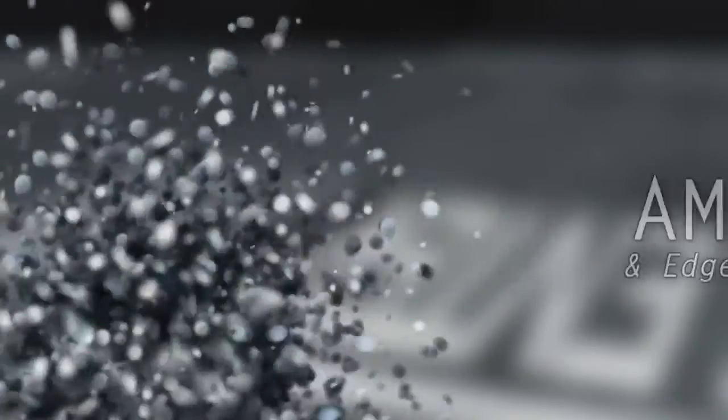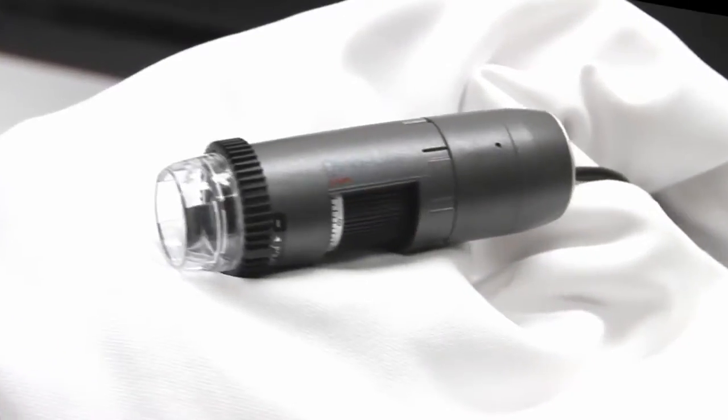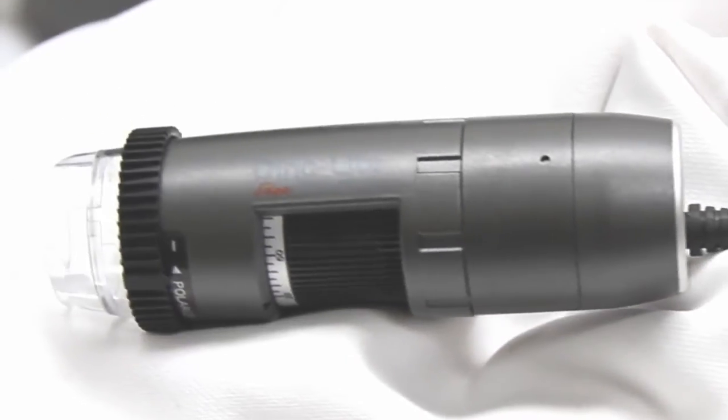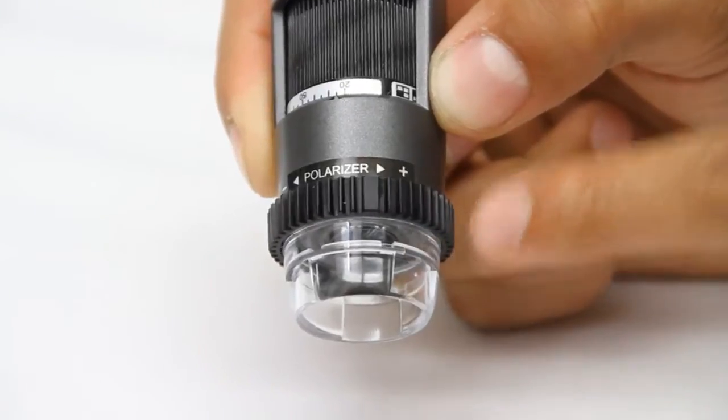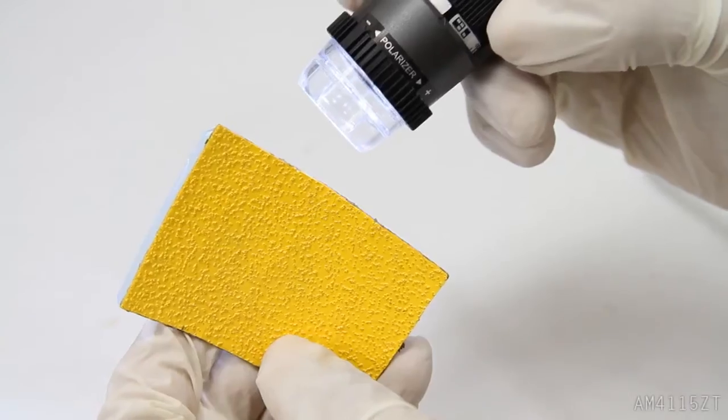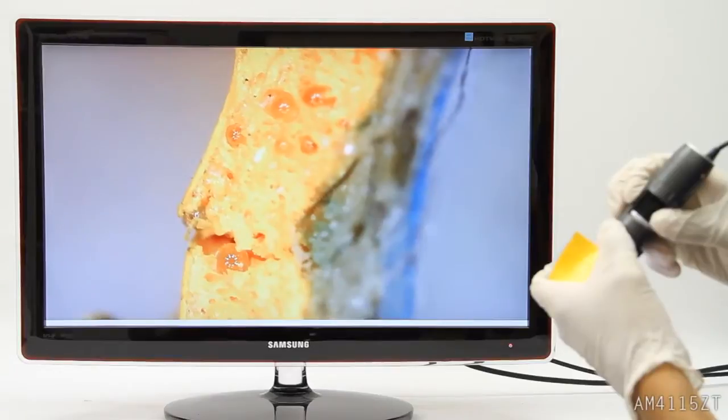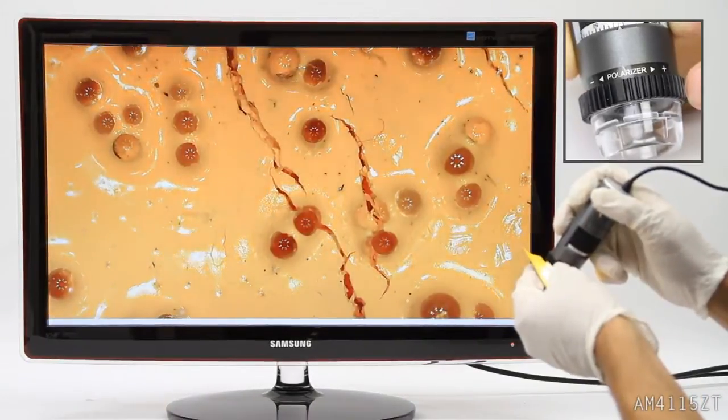Introducing the AM4115ZT Dynolite Edge handheld digital microscope camera. The AM4115ZT is the first in the Dynolite Edge series which features a new image sensor that delivers high image quality with a state-of-the-art lens design.